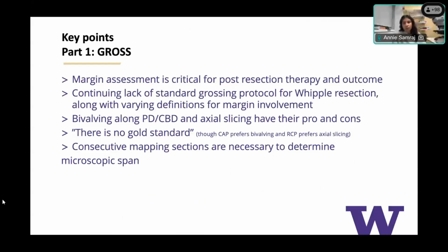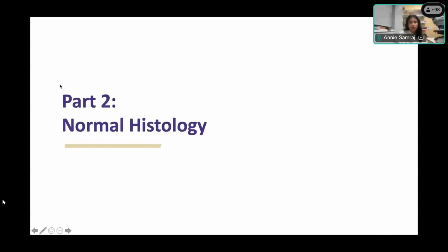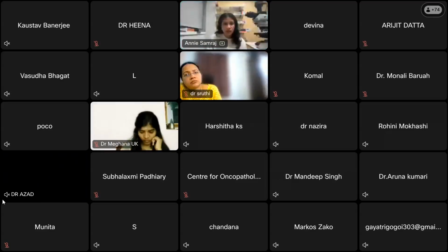And what is important while grossing is to get consecutive serial sections to determine the microscopic span. Okay, I'm just going to stop here quickly to ask Dr. Munita for her perspective on grossing pancreas.